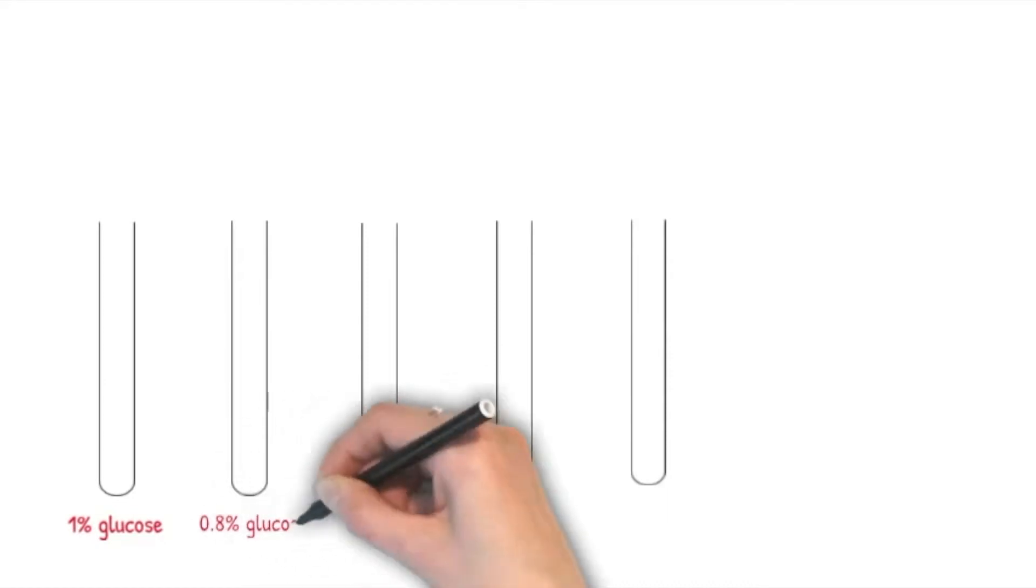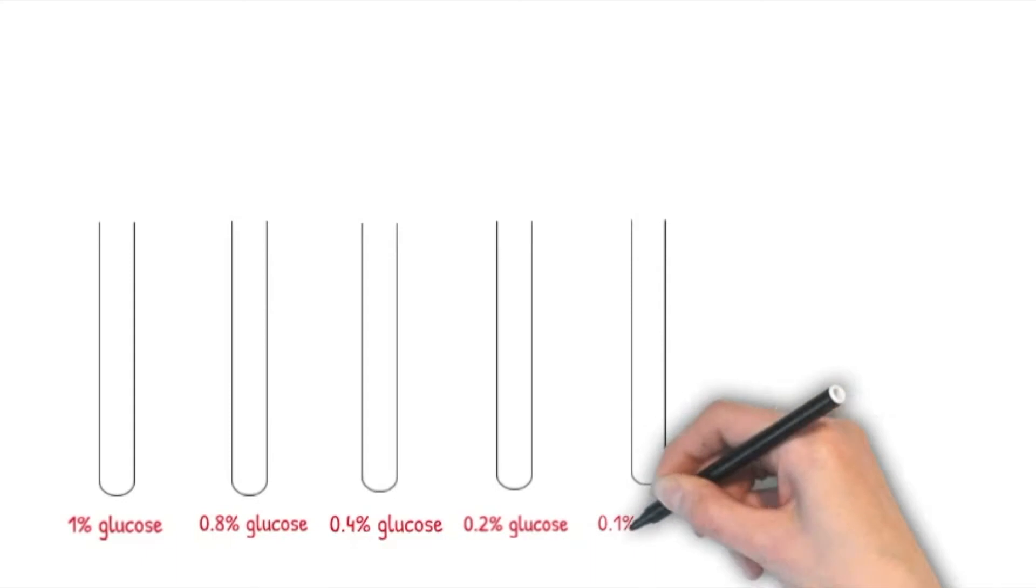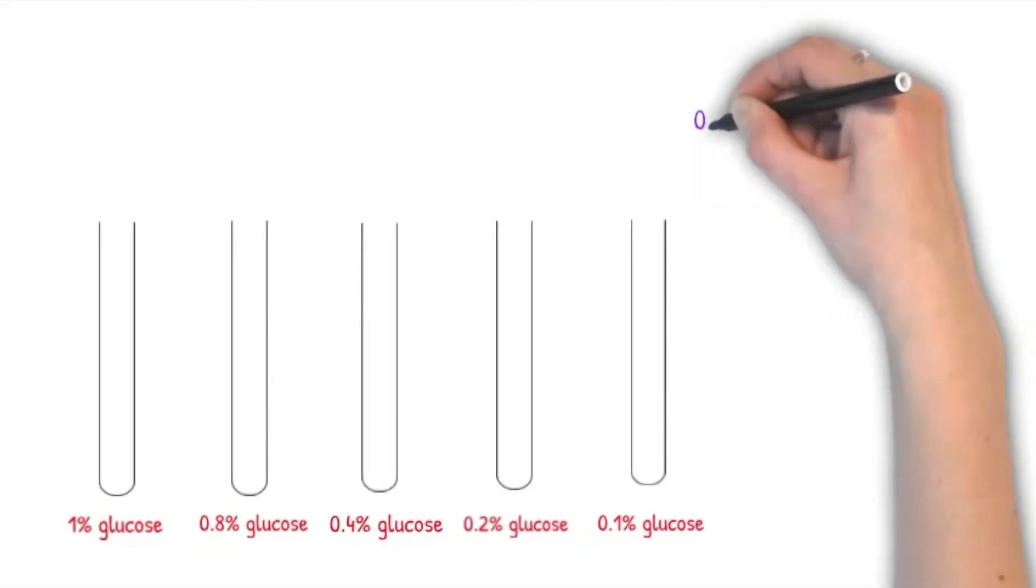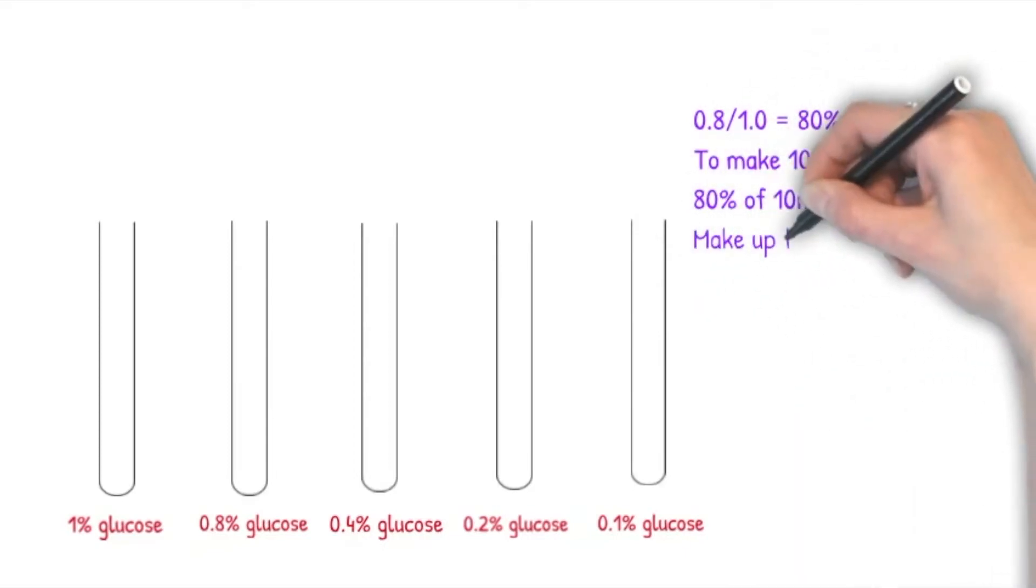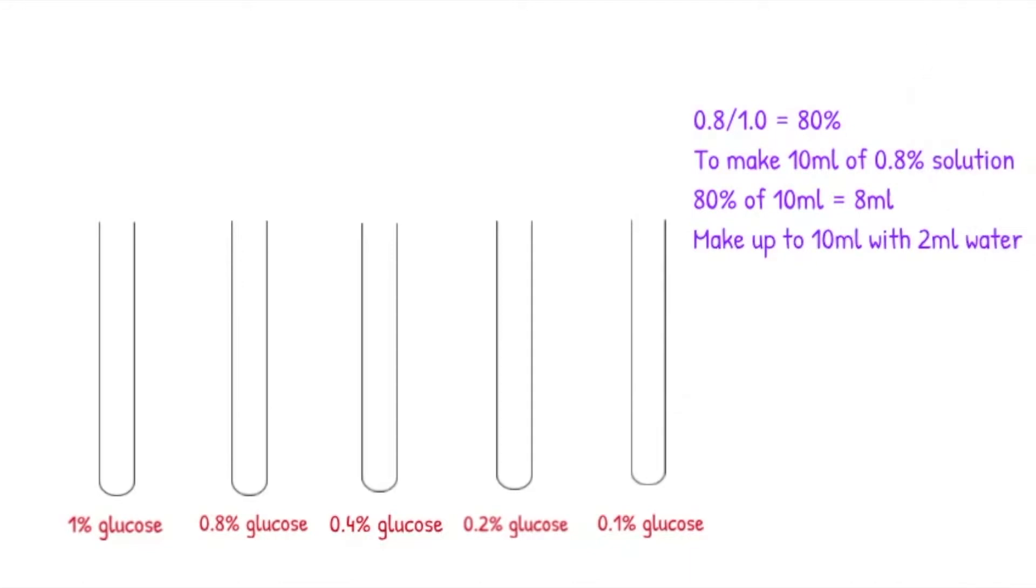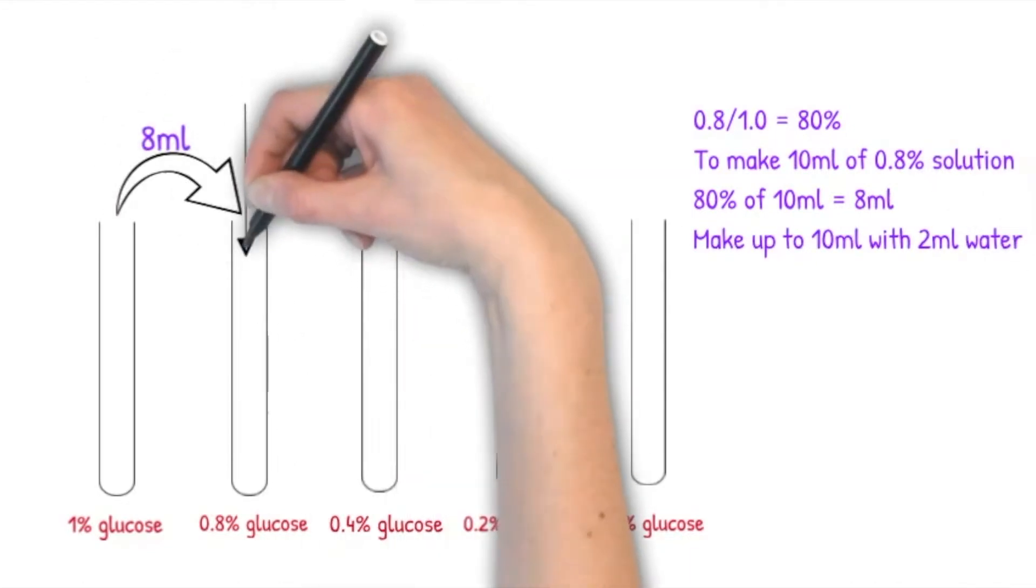Before we can start the experiment, we need to use the 1% glucose solution to make up solutions of 0.8%, 0.4%, 0.2%, and 0.1% glucose solutions by the process of serial dilutions. To make serial dilutions easier, it is often best to make the solutions up to a volume of 10 milliliters. For this first one of making 0.8% from 1%, 0.8% is 80% of 1%, so 80% of 10 milliliters is 8 milliliters and then we make up to 10 milliliters with 2 milliliters of water.